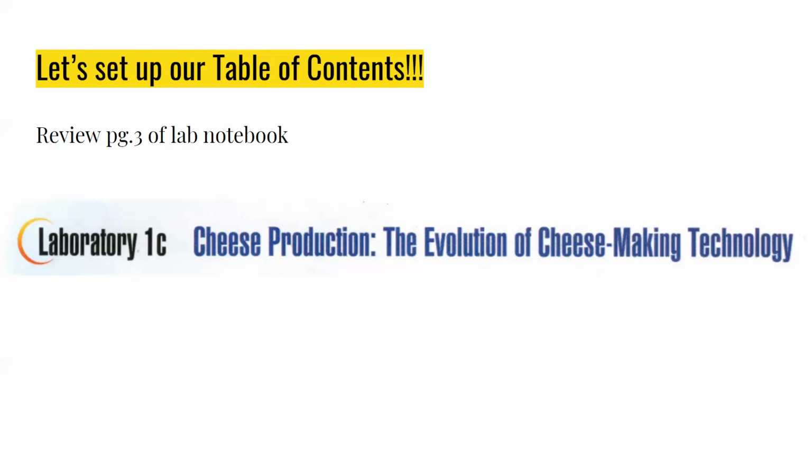Cross it out, fix it. Then yes, your initials and the date. What is it? 8:31? If there's a really neat way to fix it, you could try to fix it. But if it's not neat, cross it out, fix it.